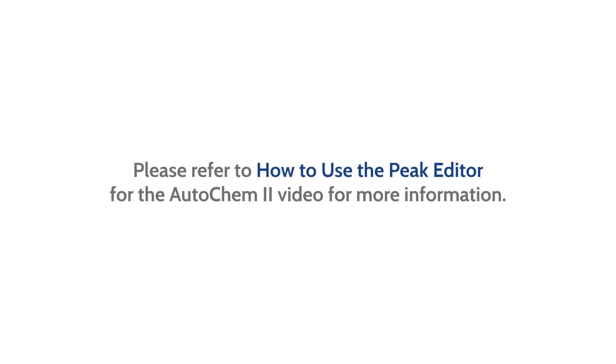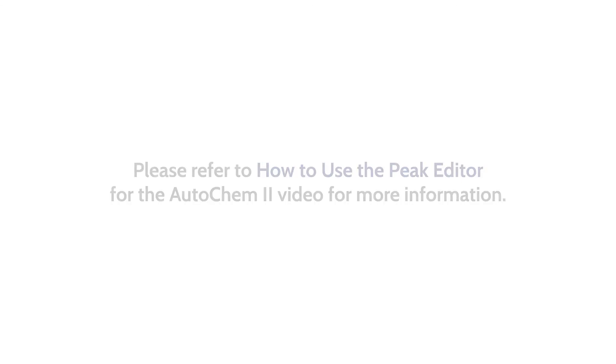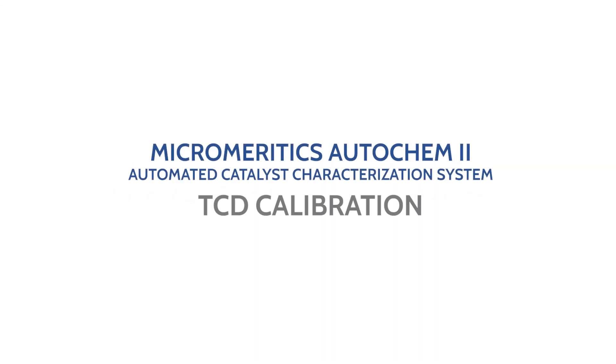To learn more about how to integrate peaks, please refer to our How to Use the Peak Editor for the AutoChem 2 video. And that completes the demonstration on how to run a TCD calibration on the Micromeritics AutoChem 2 Automated Catalyst Characterization System. For more information, visit micromeritics.com/learn.